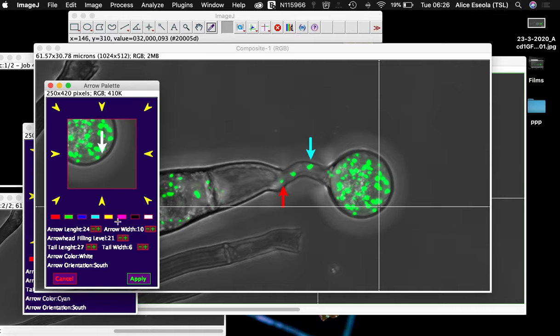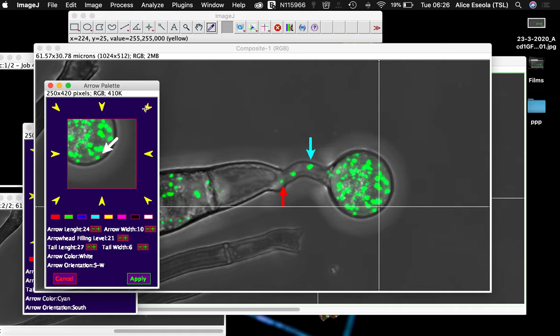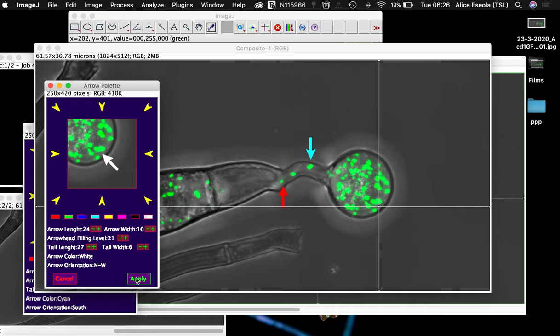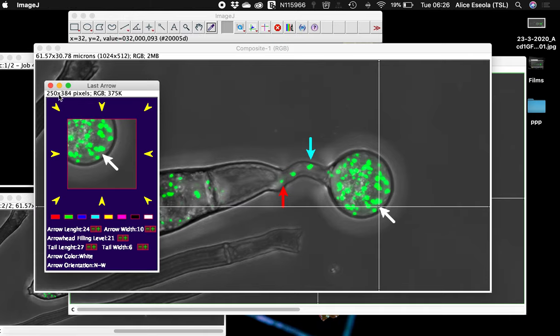And let it point from a different angle. You see, that's better than pointing from here. This is better. And we click apply.